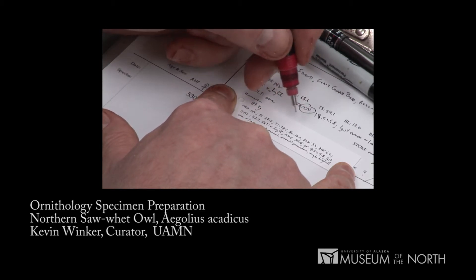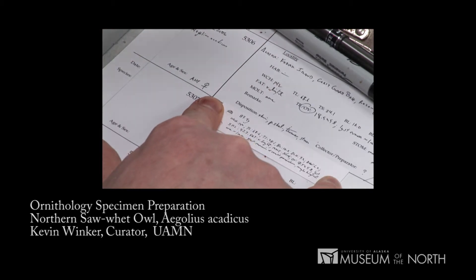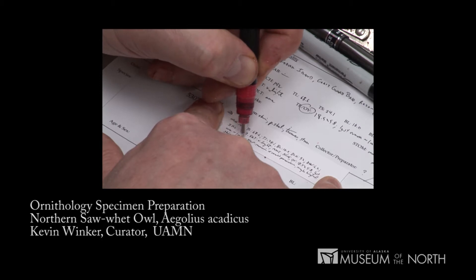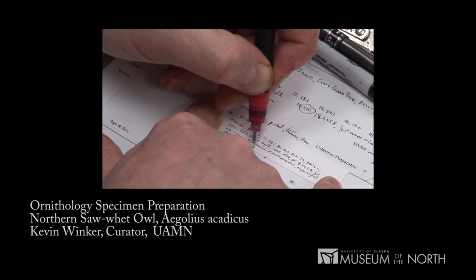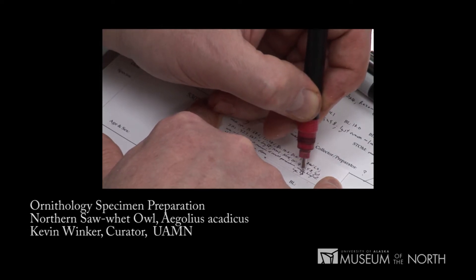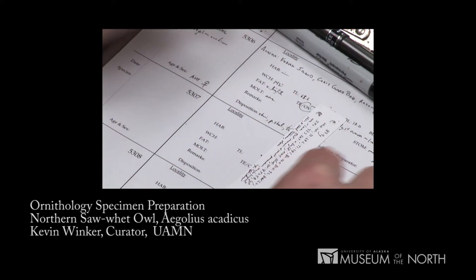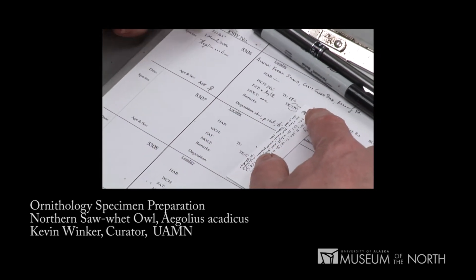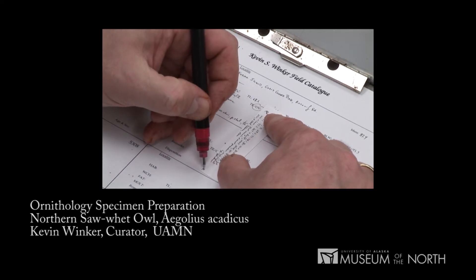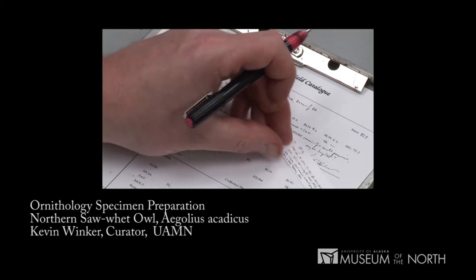When I have bad handwriting, as I do with this one, I will put this label with the skeleton. Disposition: skin, partial skeleton, tissues — this means genetic tissues — stomach. Then the preparator is me, K. Winker. And finally, the single number that ties all those parts together is KSW field catalog number 5306.